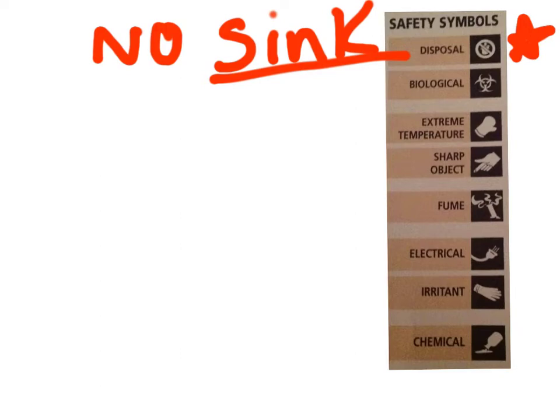The next one is the biological symbol, and that one means that there are organisms or a biological material that's going to be harmful for you. We really don't come across this much in our class at all, since we're focusing on inorganic chemistry for most of the year.